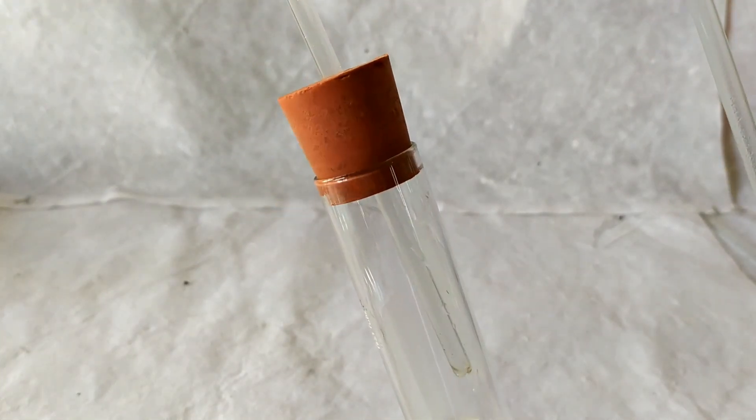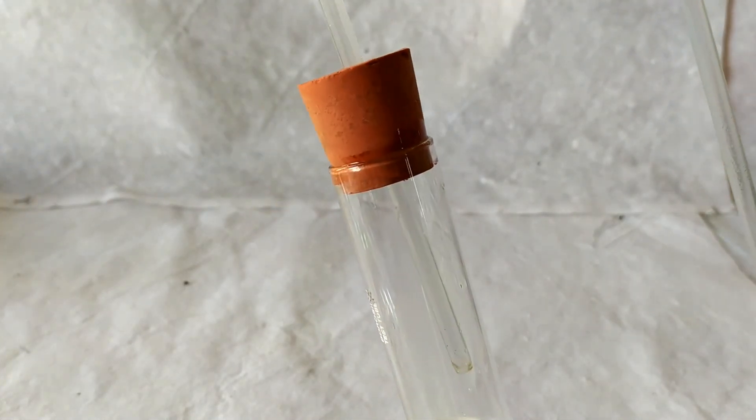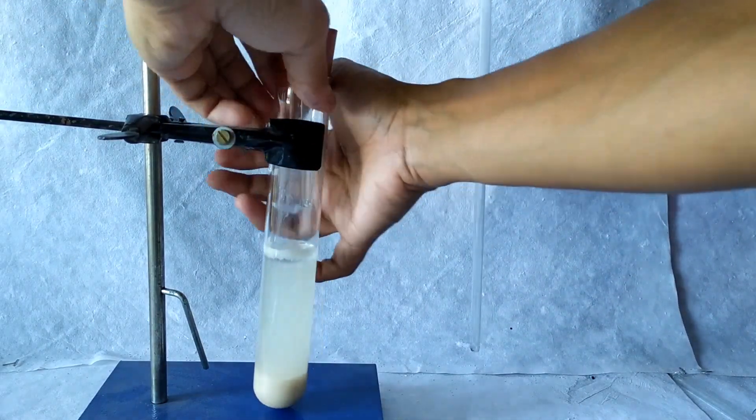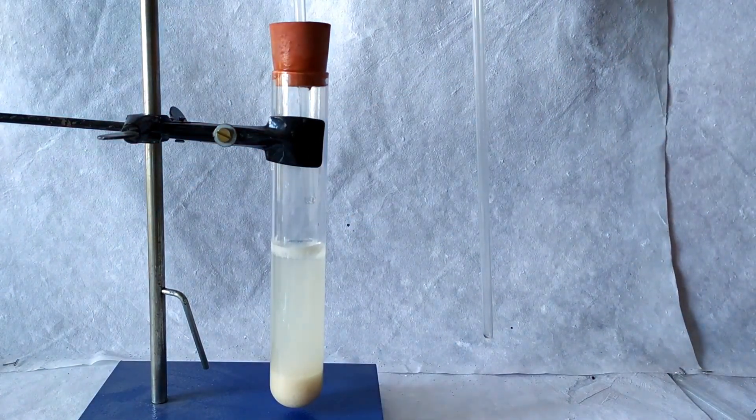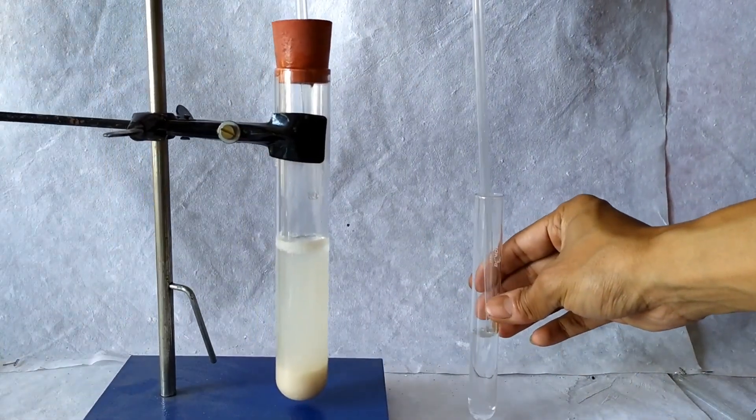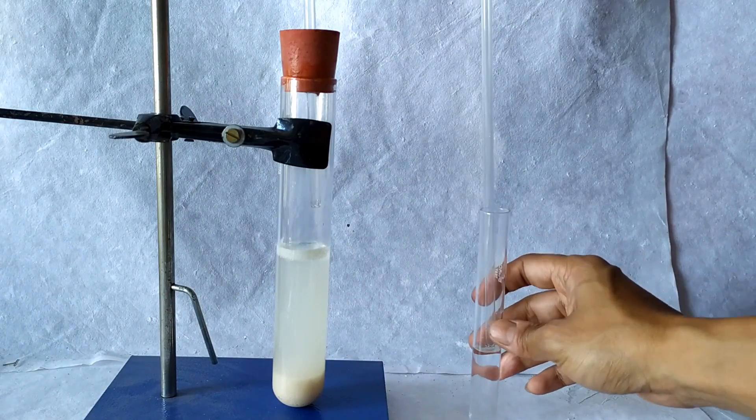Now seal the cork using glycerol or grease. Secure the test tube using a clamp stand. Once the tube has been secured, introduce the other end of the delivery tube into the smaller test tube containing lime water, making sure that the end of the tube is immersed well below the level of the lime water.